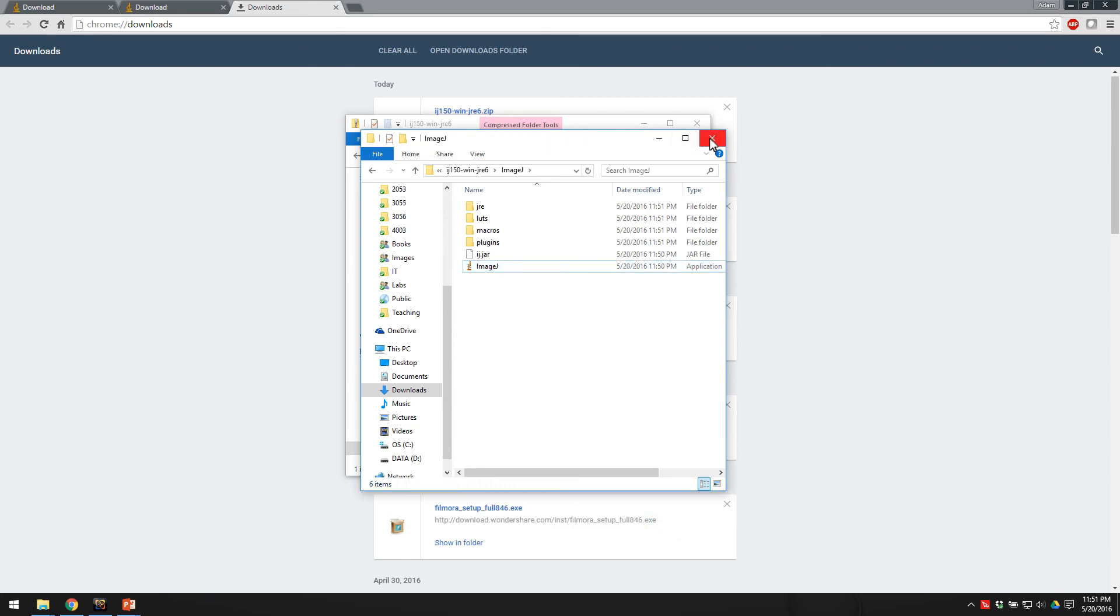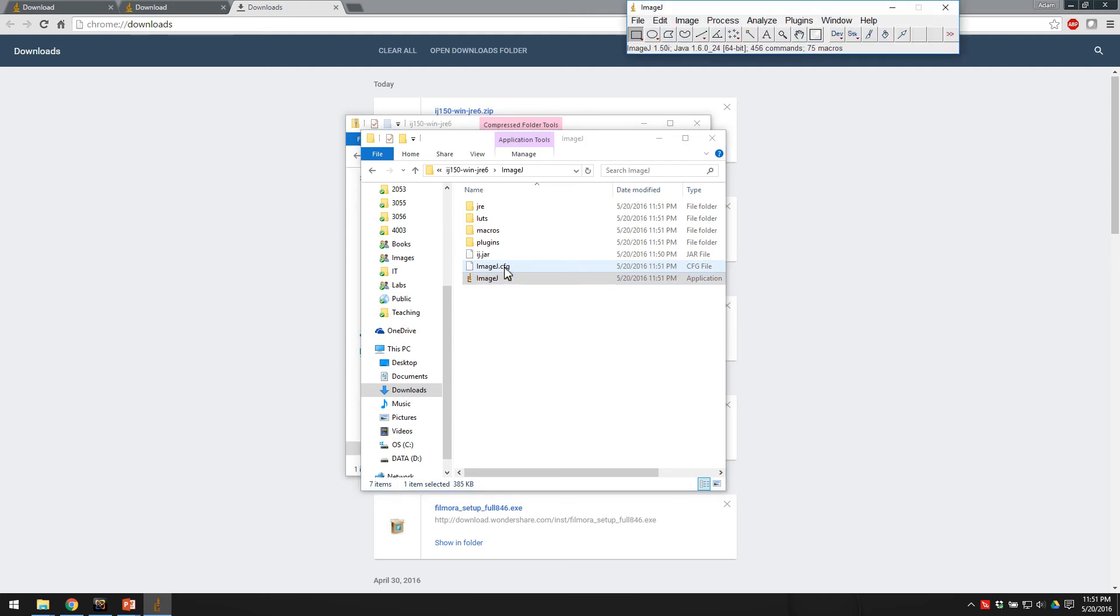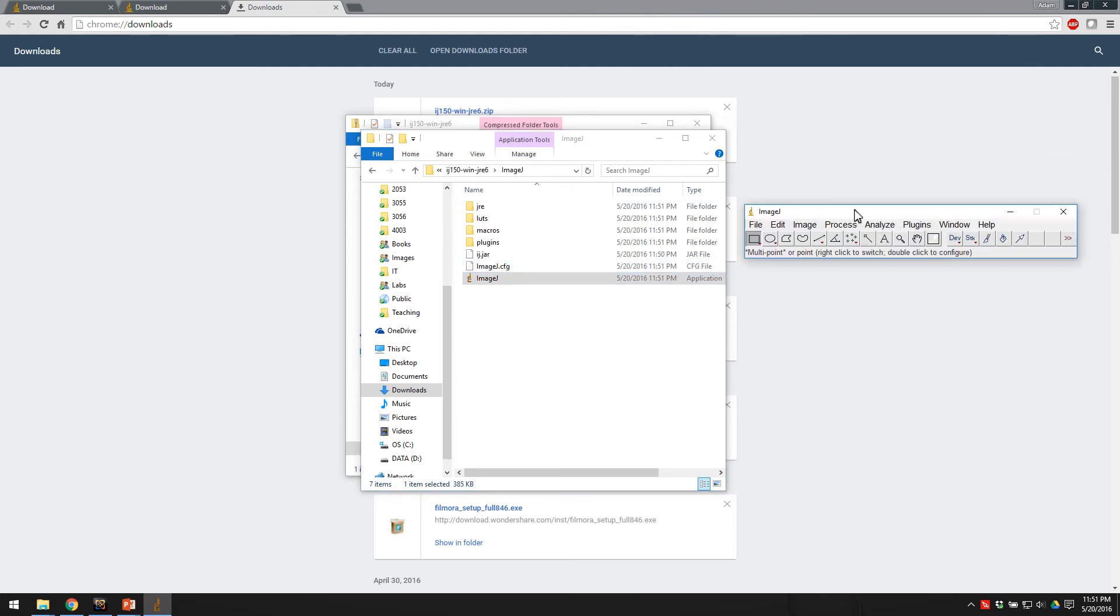Okay, so the next tutorial will be basically showing you how to use this program. Let's just make sure it works. So this is pretty much all you should see when you open the program. Okay.